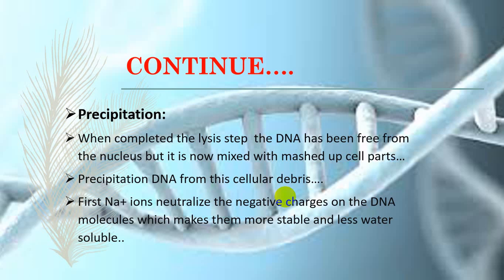First, sodium ions neutralize the negative charge on the DNA molecules, which make them more stable and less water soluble. So then what we do, we add, as I mentioned, the saline solution. So in the saline solution, the sodium ion neutralizes the negative charges on the DNA. So sodium charges जो होते हैं वो DNA के ऊपर जो नेगेटिव चार्जेस होते हैं उनको न्यूट्रलाइज कर देता है, which makes them more stable and less water soluble. तो वो क्या करता है कि वो डीएनए को इस काबिल बना देता है कि वो स्टेबल हो जाता है और वाटर में थोड़ा सा कम soluble होता है. यूजुअली ये वाटर में soluble होता है.